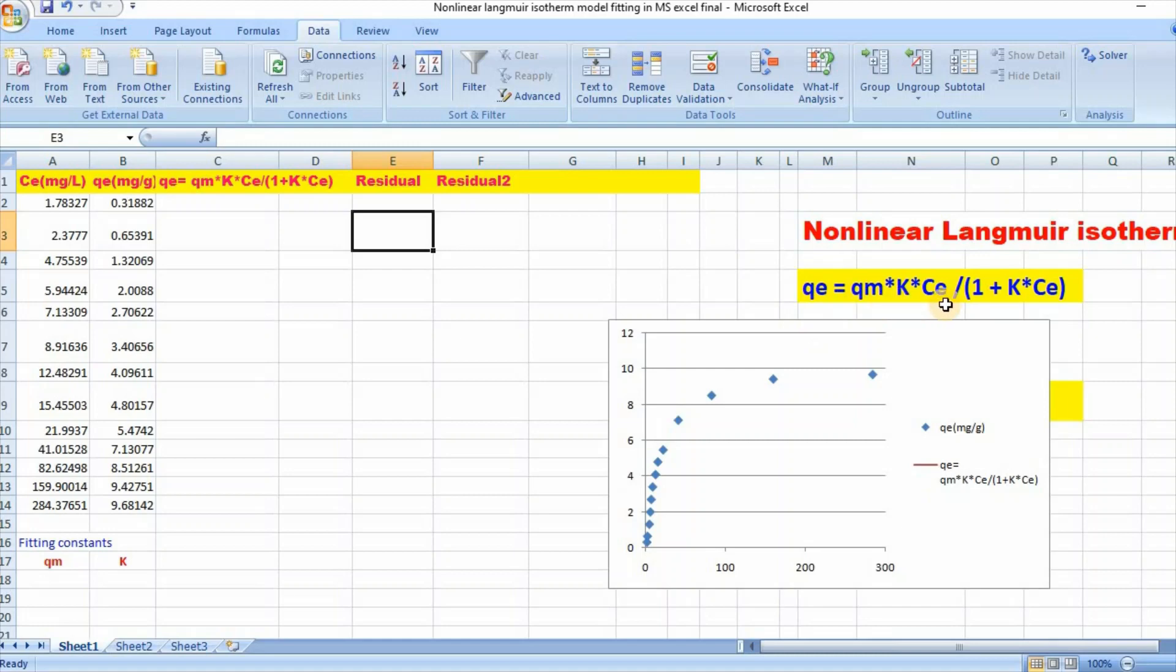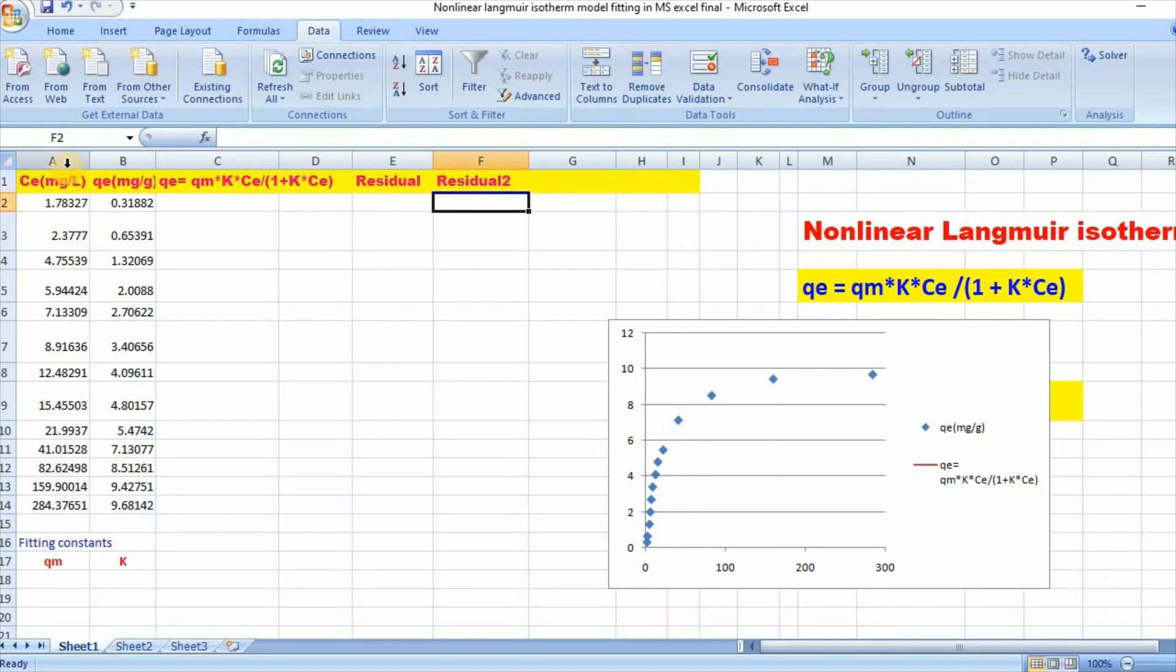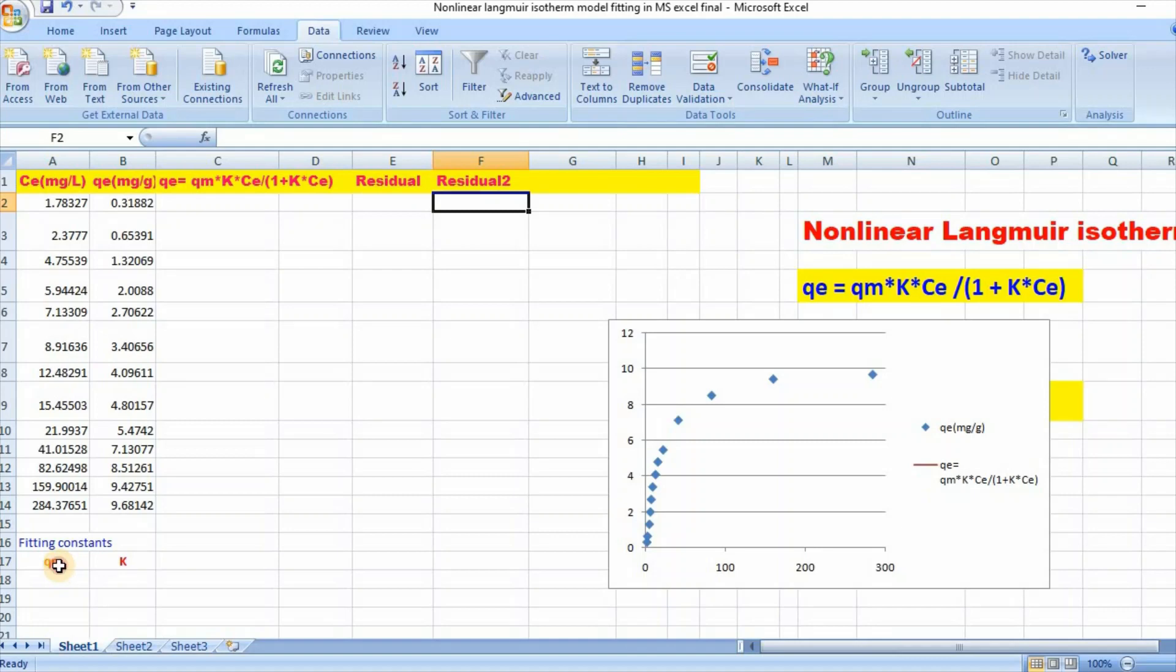In order to fit, I have taken equilibrium isotherm data for Ce and qe. Then at first, you also need to write fitting constants qm and K. So here qm is nearly 10, so write here, for example, 10.